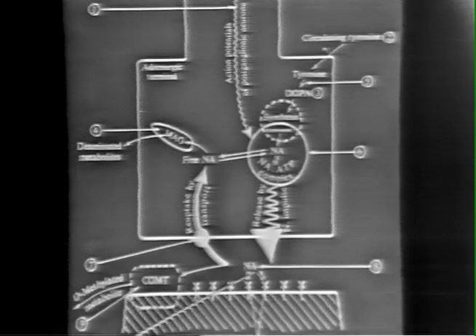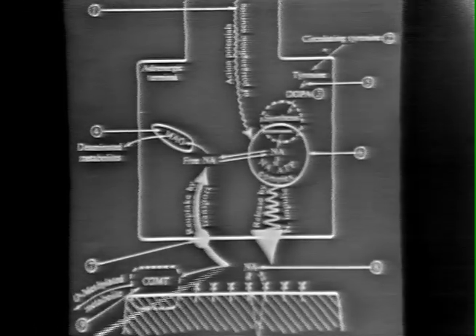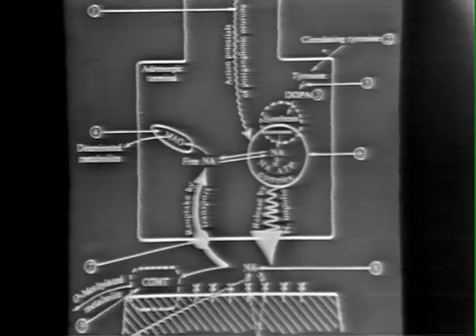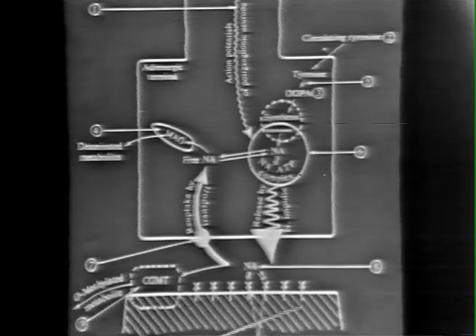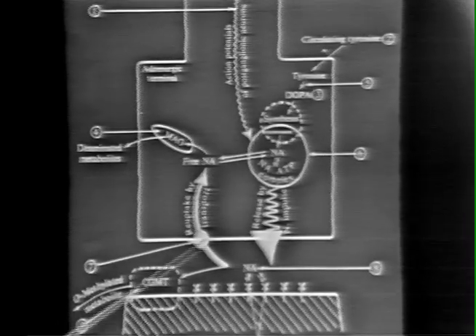If you prevent the reuptake of the liberated catecholamine back across the neuronal membrane, by blocking this process with cocaine, you will cause, first of all, a higher concentration of norepinephrine to be attained in the receptor area, and you will also prolong the response, since the reuptake process, again, is the main process by which this amine is removed from this area.